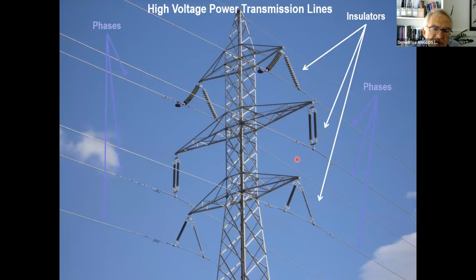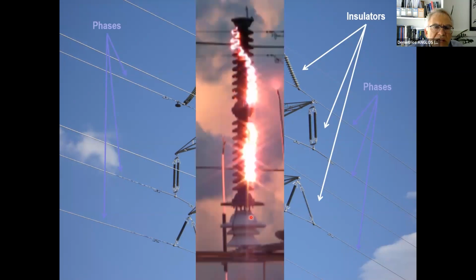These insulators are made of silicon rubber, and sometimes they sustain a heavy burden, and we have phenomena like this one.